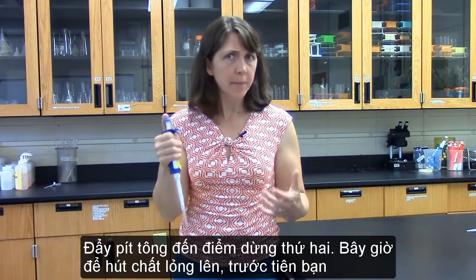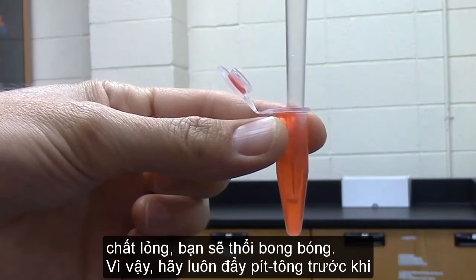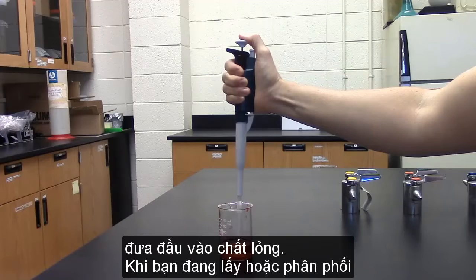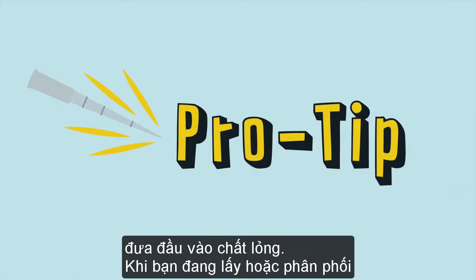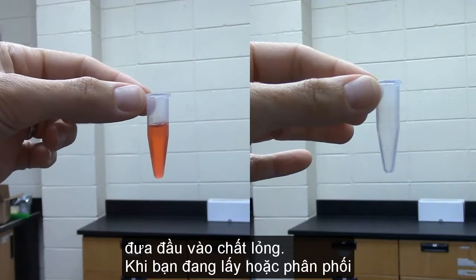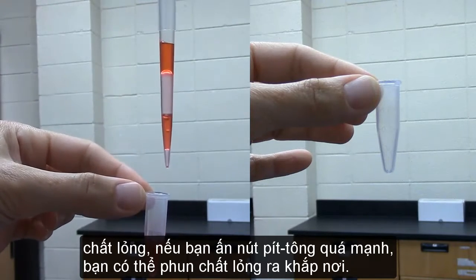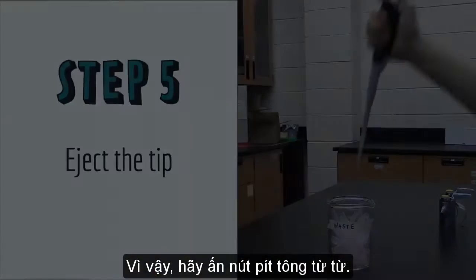Now, in order to draw up liquid, you have to push the plunger down first. But if you do that when the tip is in the liquid, you'll blow bubbles. So always push the plunger before putting the tip in the liquid. When you're drawing up or dispensing the liquid, if you push the plunger button too hard, you can squirt your liquid all over the place. So push the plunger button slowly.